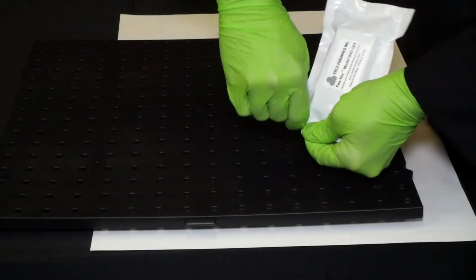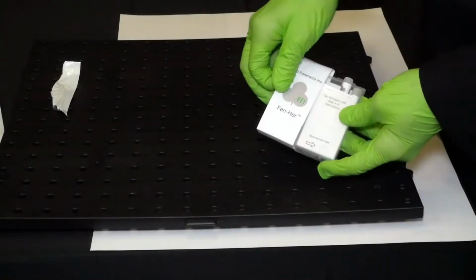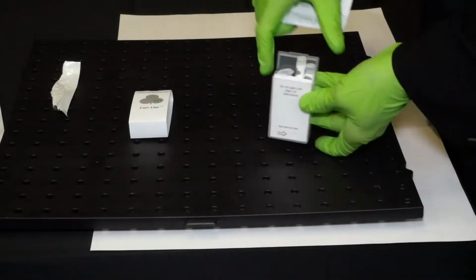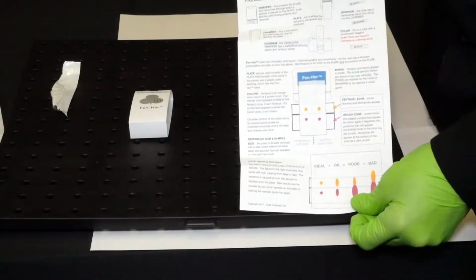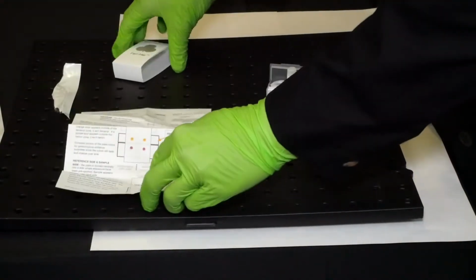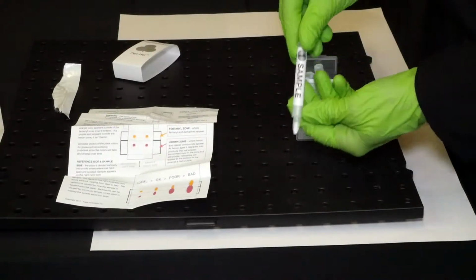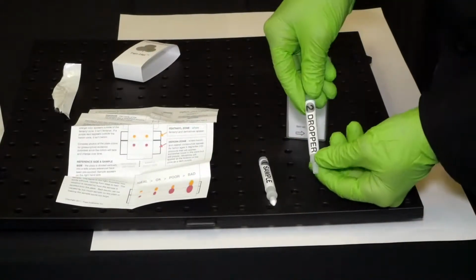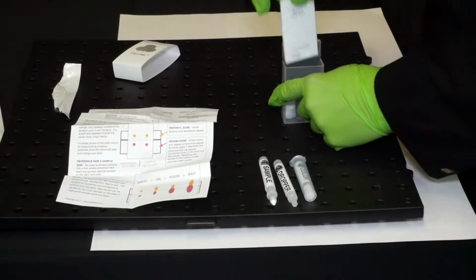Remove the Fen-Her contents from the vacuum pouch using the tear notch. The Fen-Her test contains several components, including instructions and content list. It also contains 3 pens, a sample pen, a dropper pen, and a color pen. It also contains a wrapped plate.